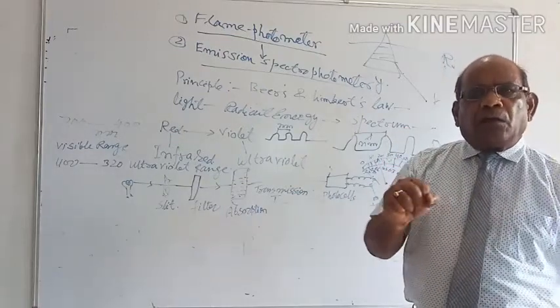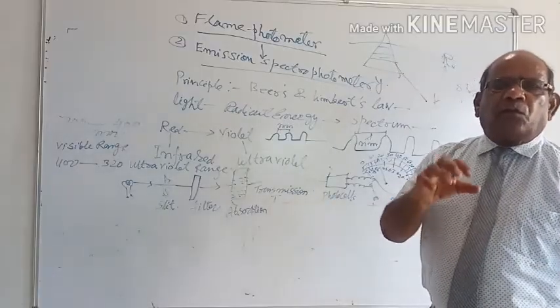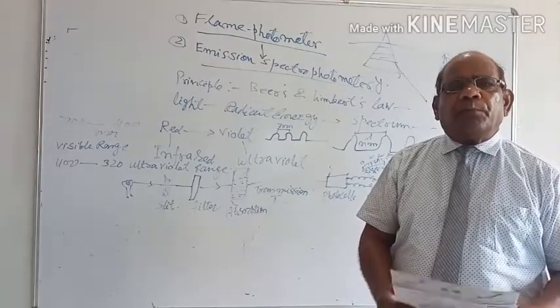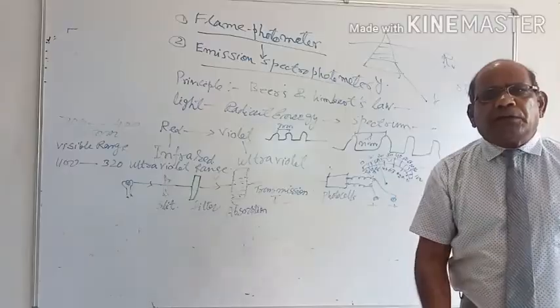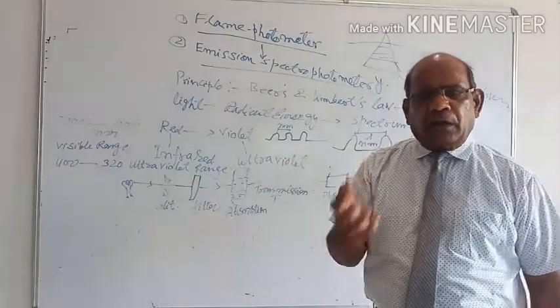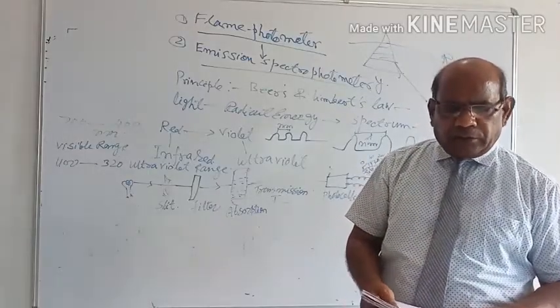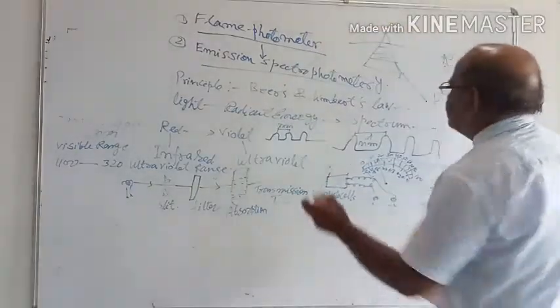Okay. Now another important technology, today I will relate to you, that is flame photometry. Flame photometry is the example of emission spectrophotometry.